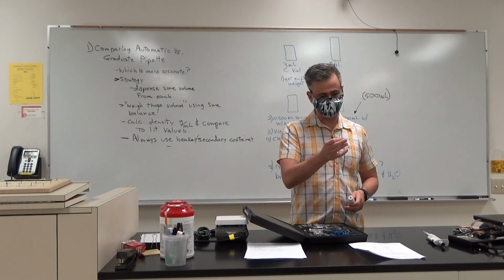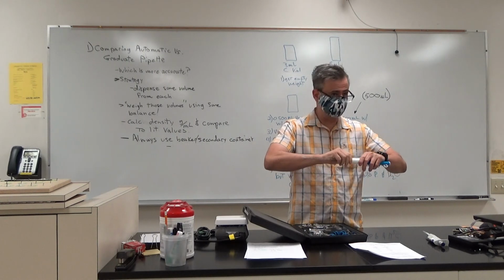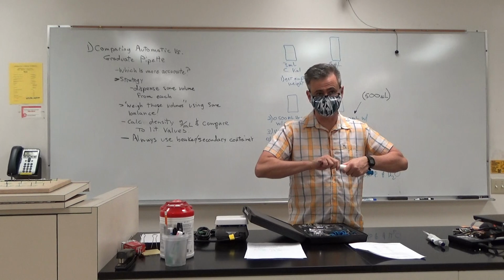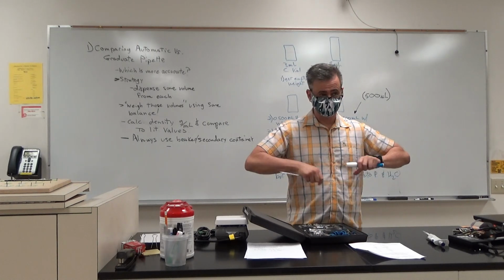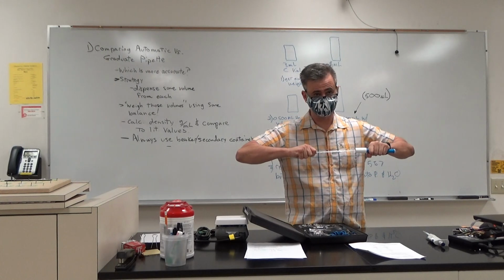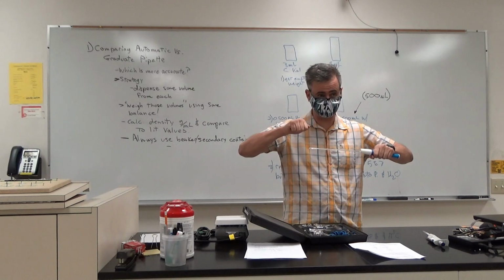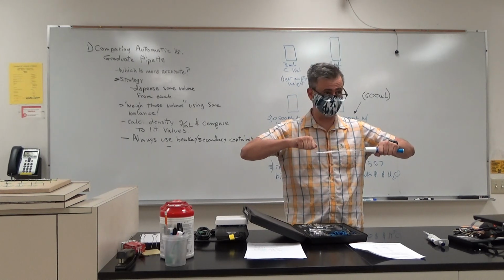So I grab it at the end here, I put it in there, and I just give it a little bit of twist. I'm not trying to lock this thing in there. Give it a little bit of twist, it's good to go. If you grab it back here and put a little force, what happens? It snaps. And which way is this hand headed? Now that I have a glass dagger in this hand, which way is it headed?